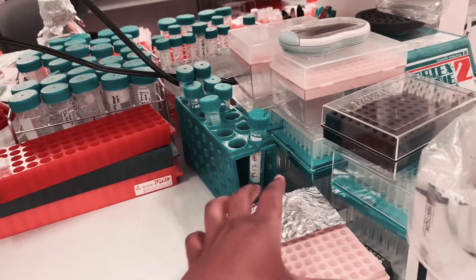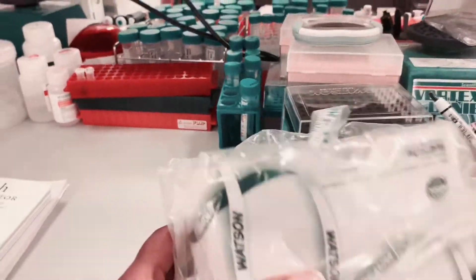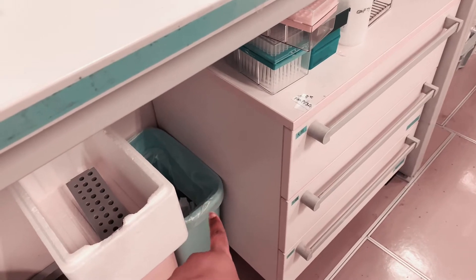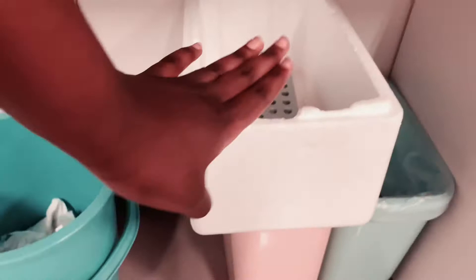I'm supposed to throw these tags away but sometimes I just keep them as a memory. This one was for my PCR last time, which went well. And this is my bin — I have another one in here: that one is for papers and that one is for biohazard stuff. And I've got my aspirating tube thingy with this wrap.